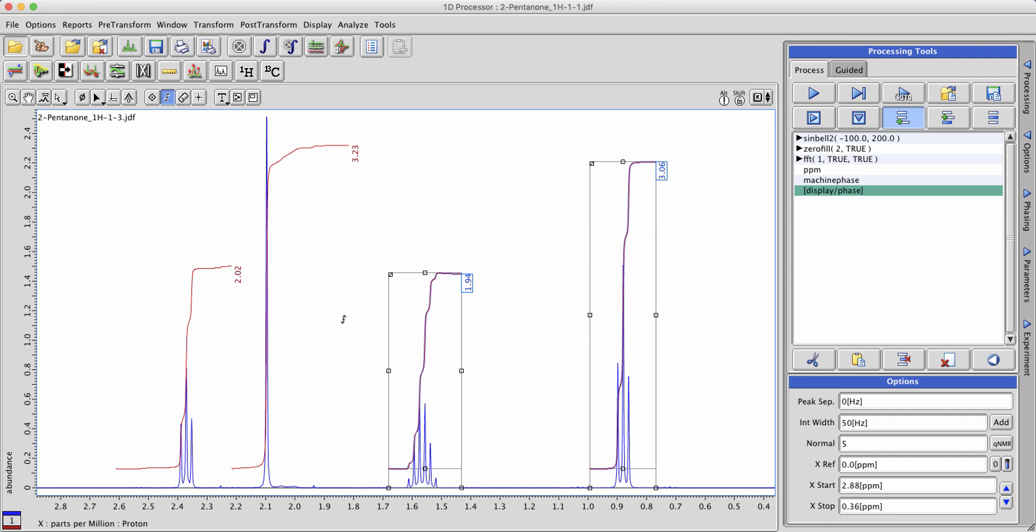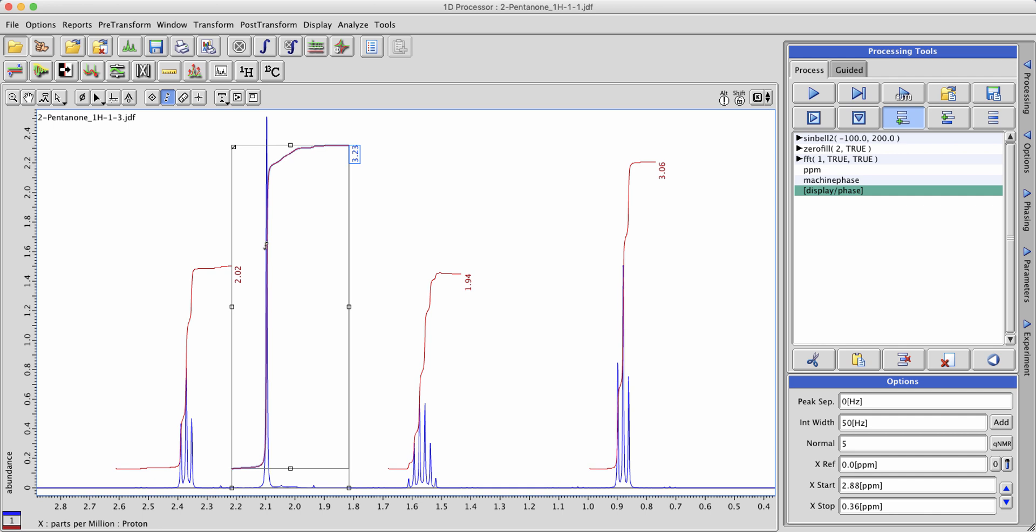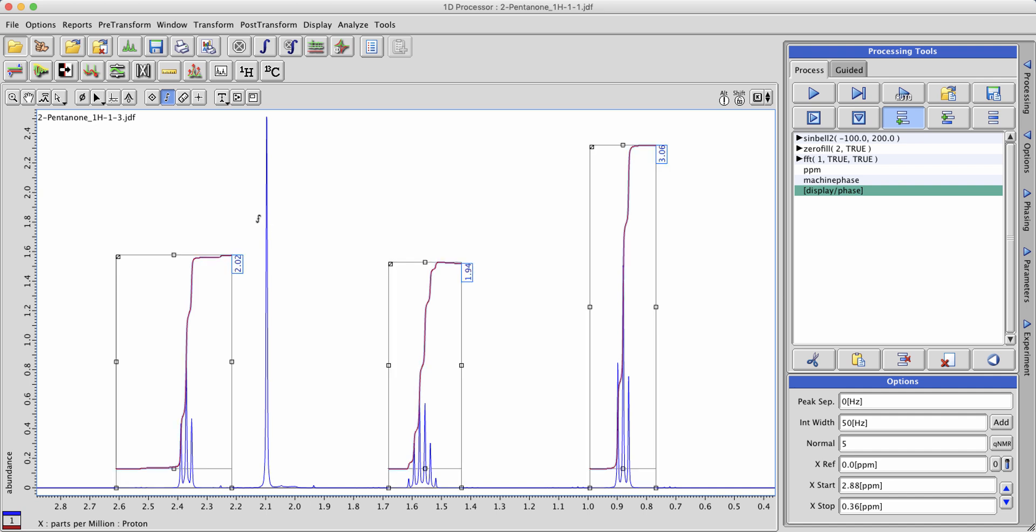Let's say you wanted to get rid of an integral instead. You can select the integral and simply hit the delete key on your keyboard. Or if you'd like to get rid of all integrals, press the A key on your keyboard to select them all and hit delete that way.